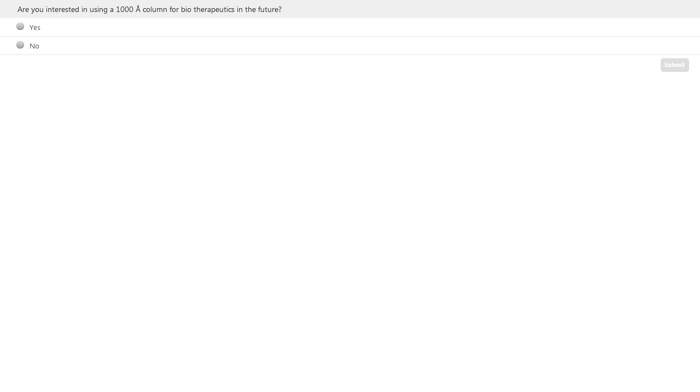Someone asks, what will be the typical number of injections for a purified monoclonal antibody on a column under regular conditions before any changes in profile or resolution? All right, which one is that? Can you help me figure out which? I'm looking at the list here. It's the top question on the list. Top question?